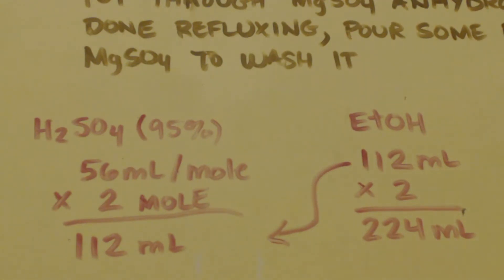I'm putting water in. All these ratios, everything is based on me not having water. And I'm not going to do that because I want to see what happens. How much of a loss I get just from doing it without doing anything that is sulfuric acid. And only getting, only distilling the ethanol. And that's it. Just distill it. Don't dry it up better than an azeotrope. Let's see what happens.